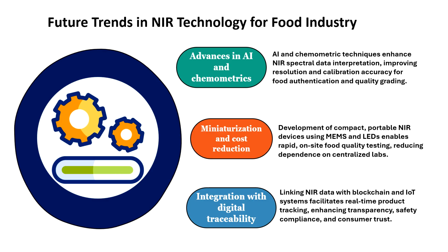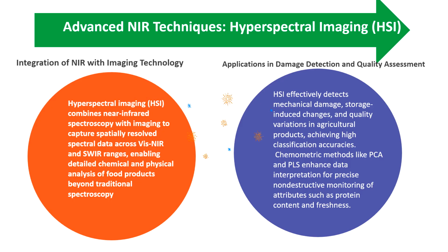Integration with digital traceability. This includes linking NIR data with blockchain and IoT systems, which can facilitate real-time product tracking, enhancing transparency, safety compliance.